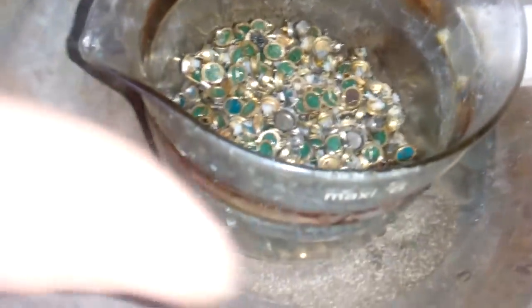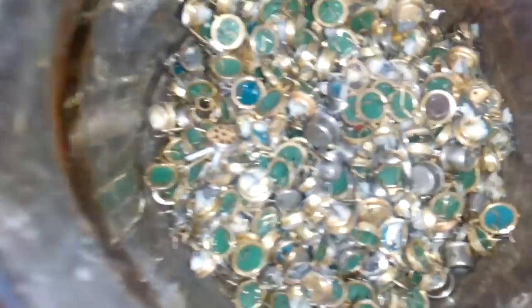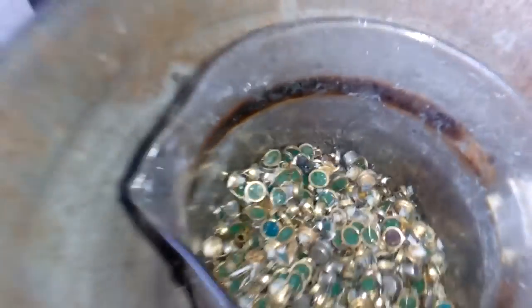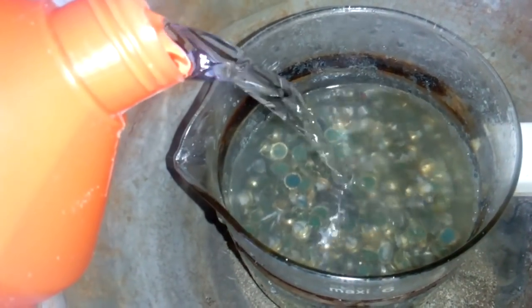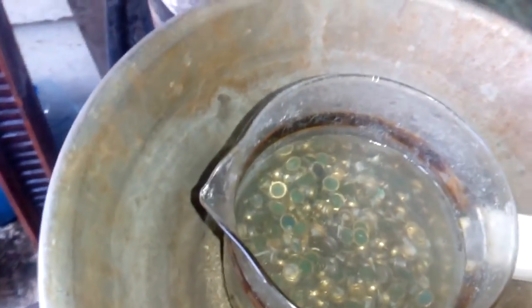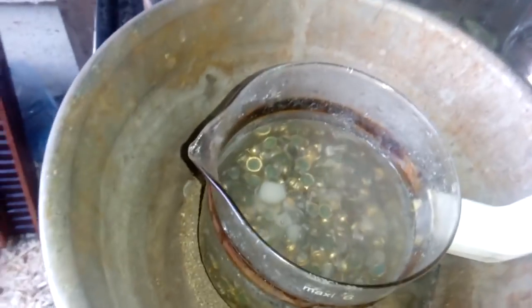After we boil that in hot HCl and we wash that with water a couple of times, now we got clean transistors. So what we do next is we will add some HCl to make some Aqua Regia. This time we will work with the Borsman Aqua Regia.